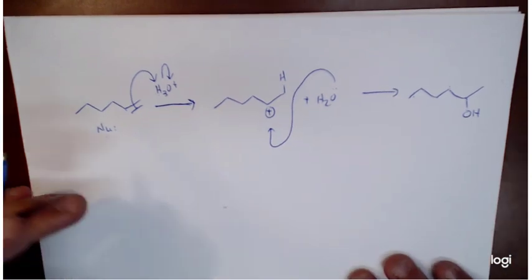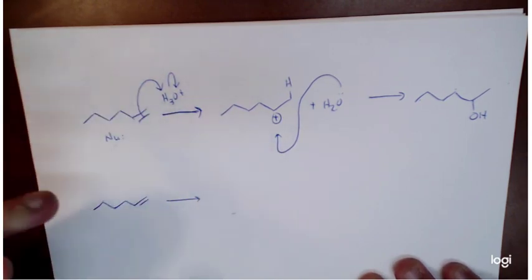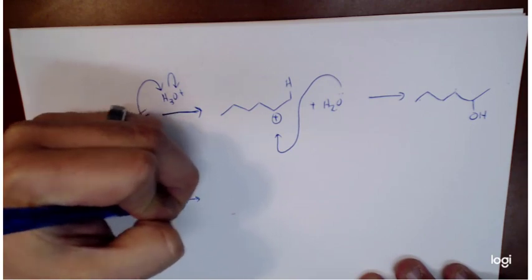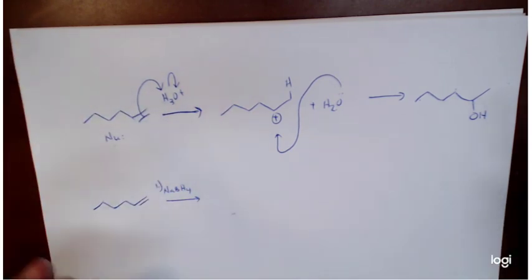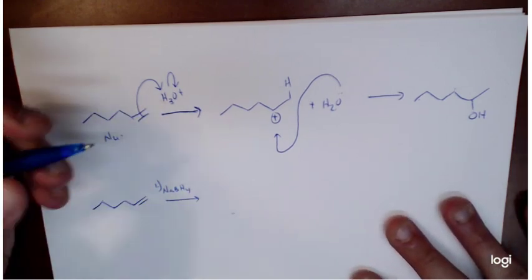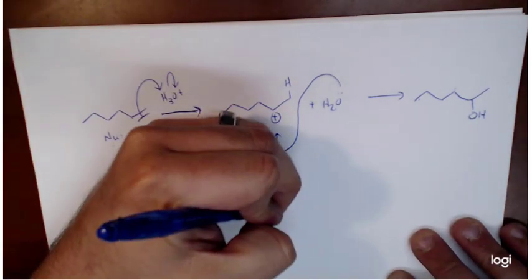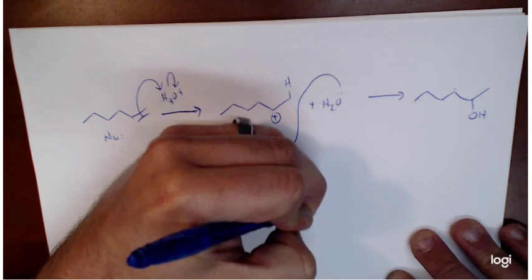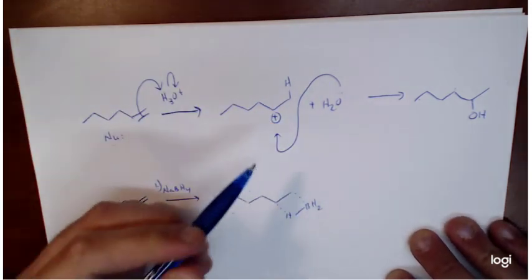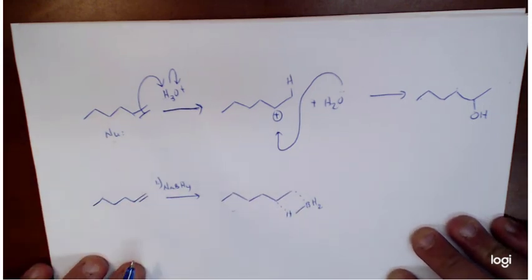For our sodium borohydride, when we utilize that, we are still seeing an addition reaction, as I said before. And the first step that we see in this process, our intermediate looks very strange. We're actually going to see kind of this weird box-like structure where you have a carbon-boron bond and now a carbon-hydrogen bond.